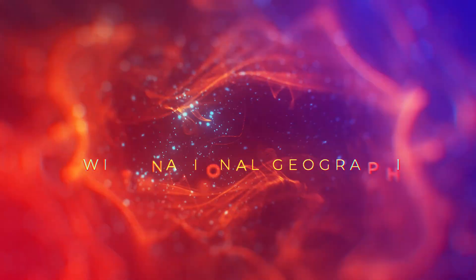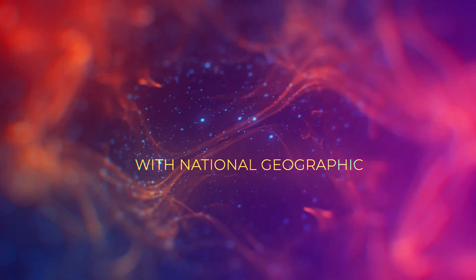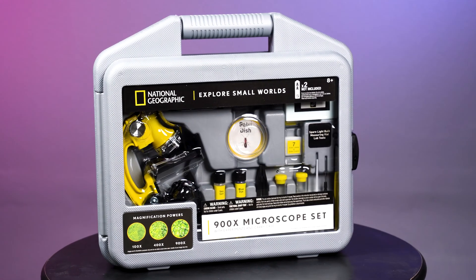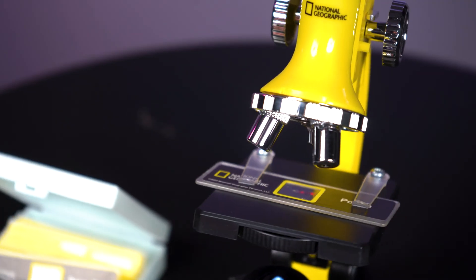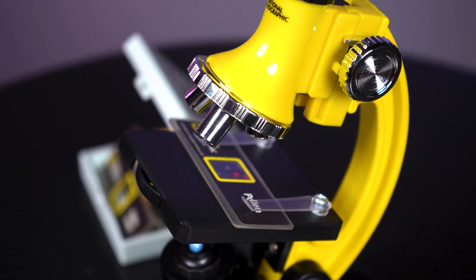Are you ready to explore the microscopic world around you? Look no further than the National Geographic 900x Microscope. With its three magnification settings and fully focusable lens, you can view any objects down to the cellular level.